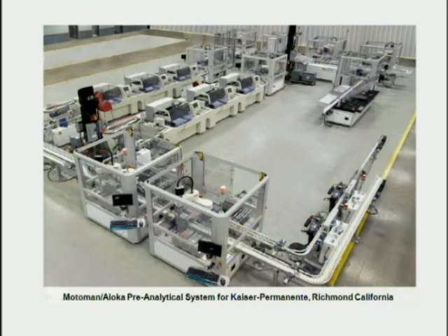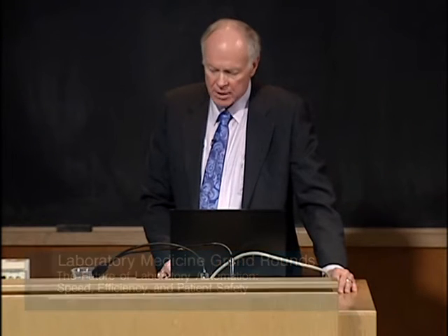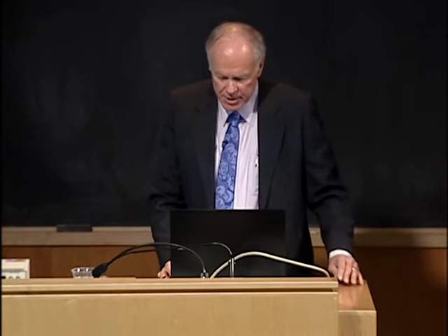And the front line that's over here in the foreground to the right is where the hematology comes off to go to their Sysmex hematology systems. There's sorting that goes to the left that then leads through these aliquoters and leads to a variety of sorting for a variety of testing. One of these sorters that's back here recaps the aliquots so they can transport them to their affiliated reference lab over in Berkeley. So this has a variety of functions associated with it, and represents an initial foray of Motoman, which has been primarily an industrial robotics company, into lab automation.